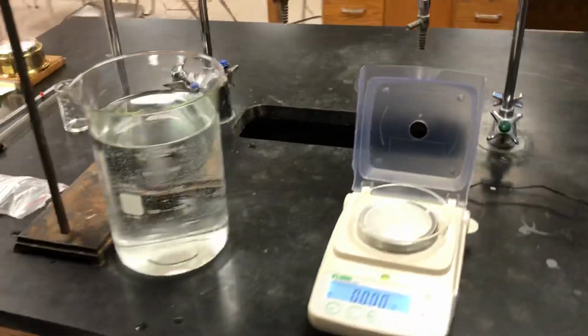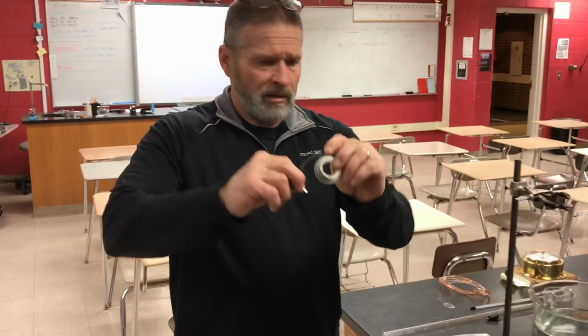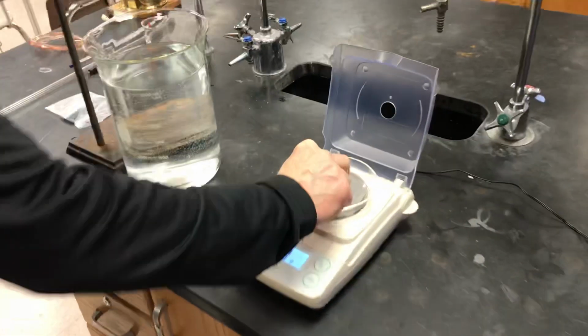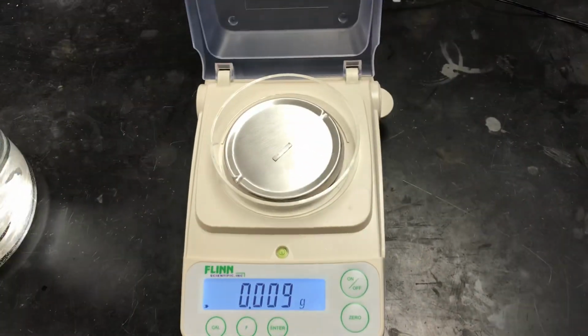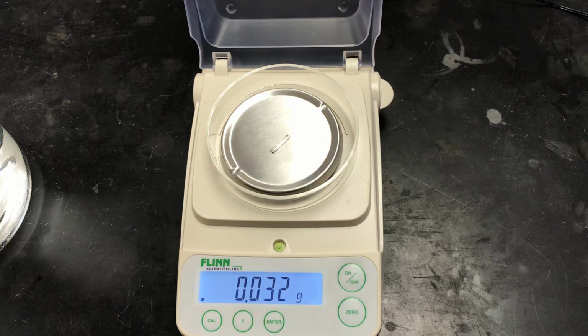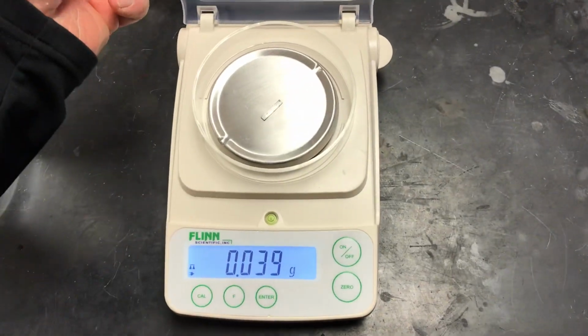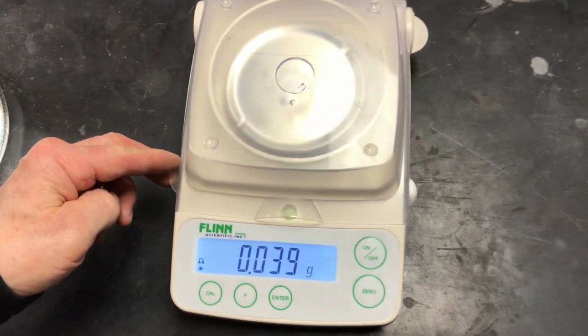The magnesium comes in a nice ribbon like this. We've broken off a small piece. Now take a look at this balance. It reads to the 1,000th of a gram.